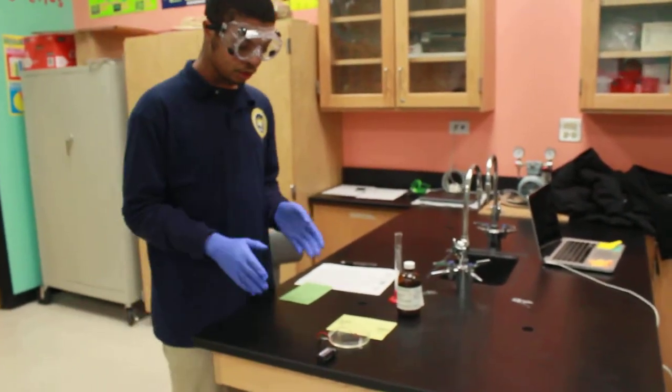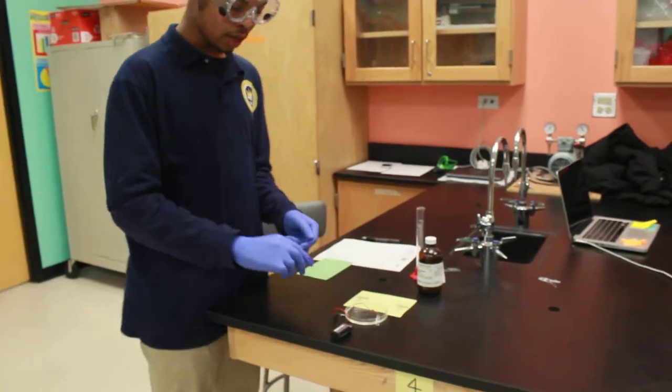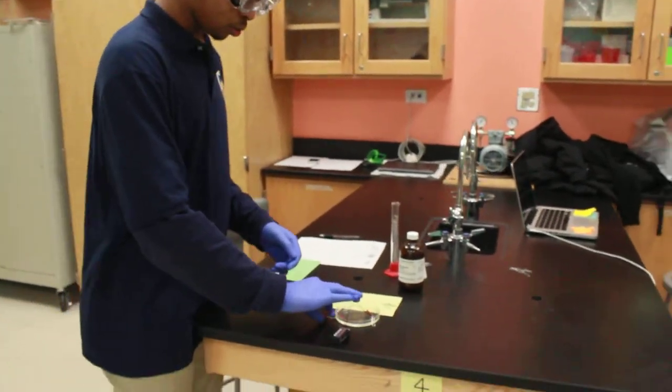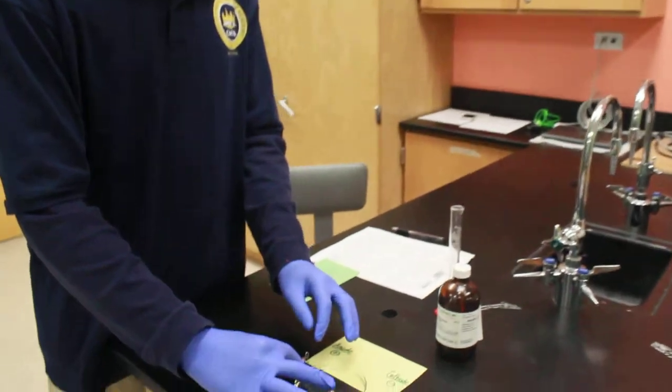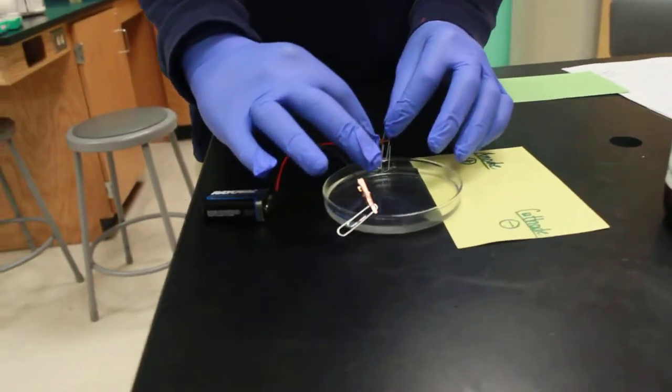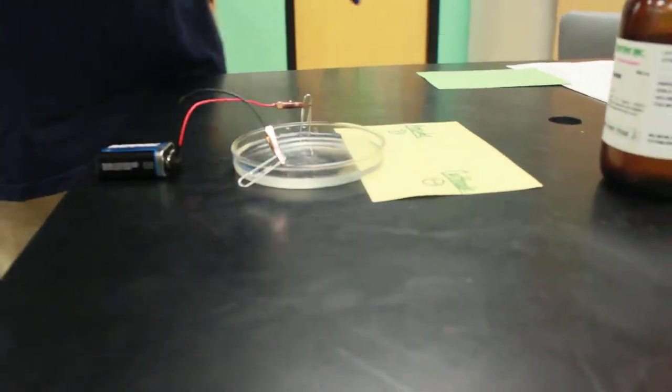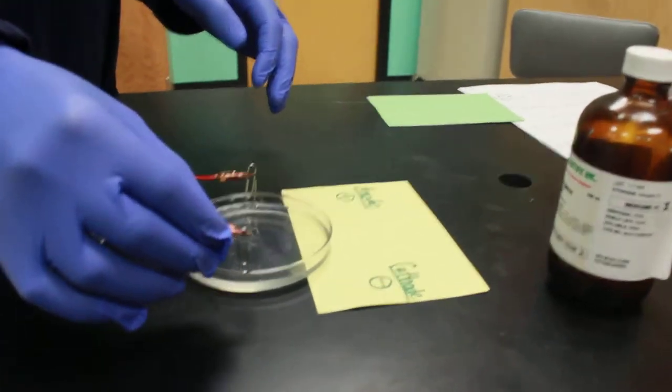First of all, we need to know that we're going to take the anode, which is the positive end of the clip, and put it onto one end of the petri dish.